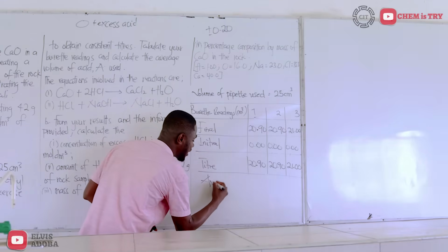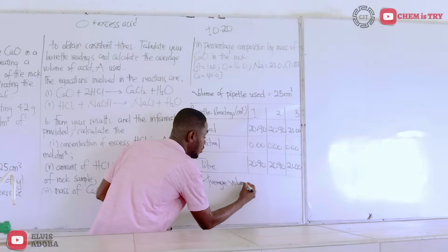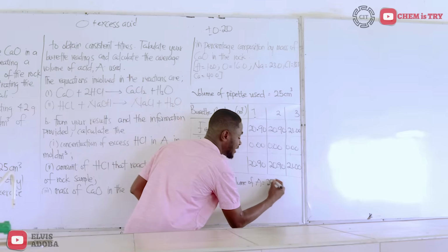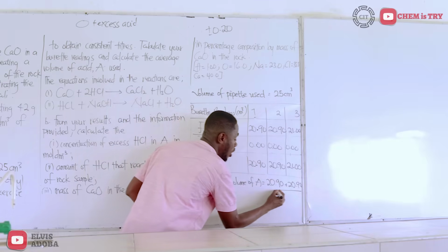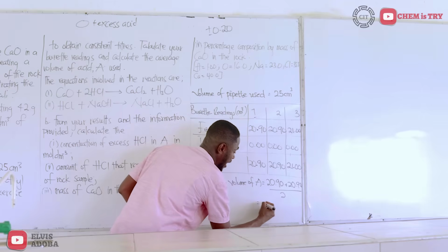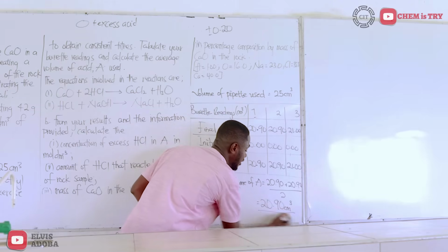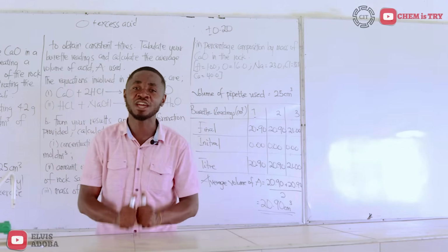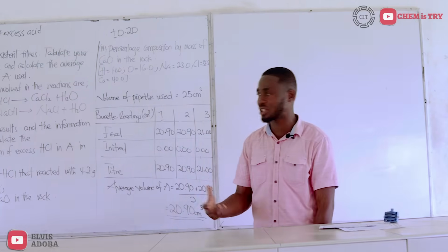So my average volume of A used will be given as 20.90 plus 20.90 all divided by 2. And that will give me 20.90 centimeters cubed. That will be the average volume of A used. These values and the information we were provided in the question.